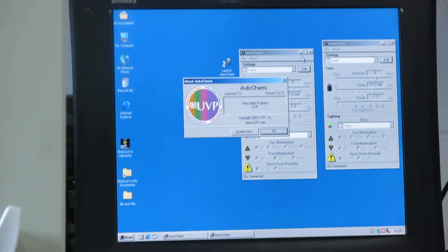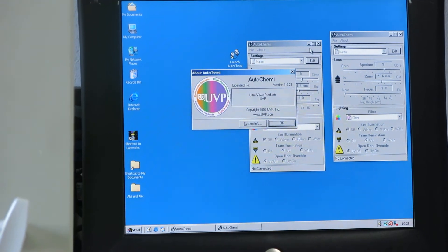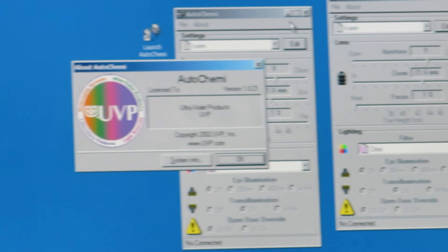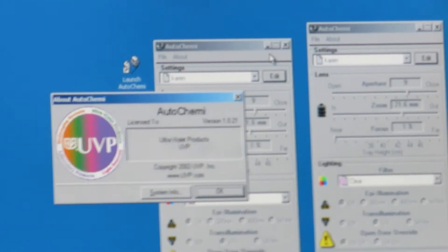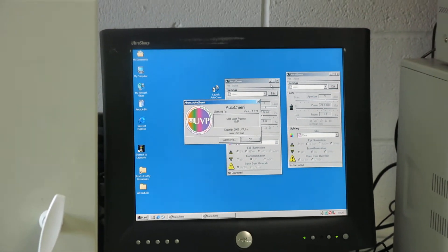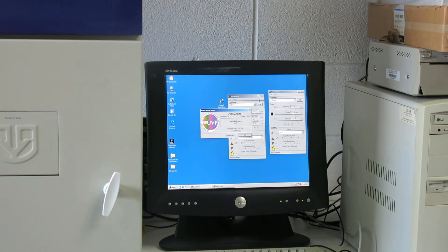Now we'll zoom in on the PC, which is here. Hopefully you can see that — this is the UVP software. So this is the AutoChemy system UVP bioimaging system: computer, hard drive, spare laser, PC monitor, and the actual box and container itself. That's all there.